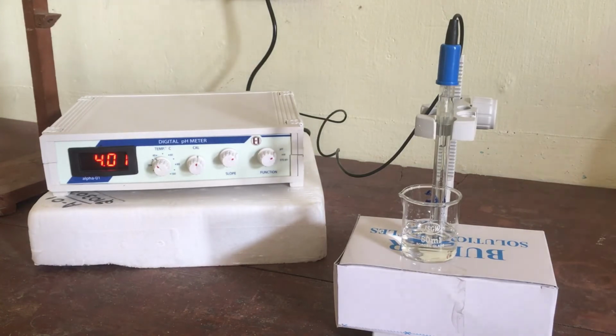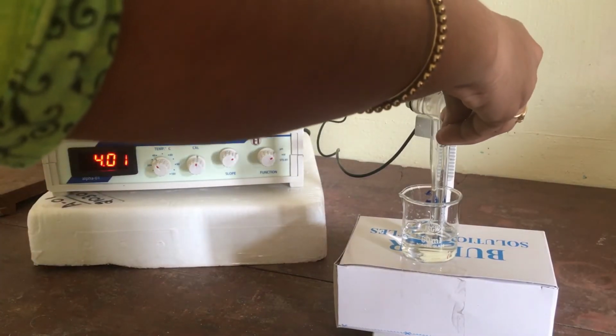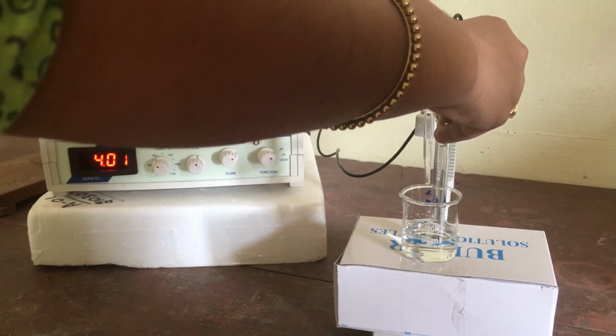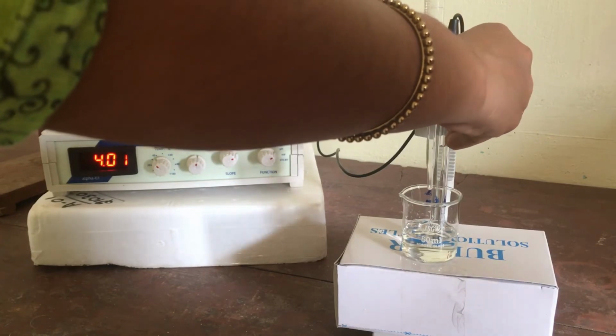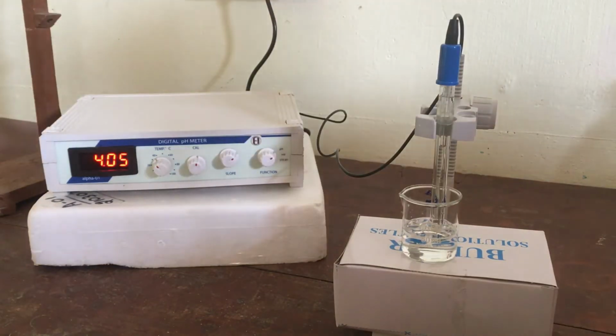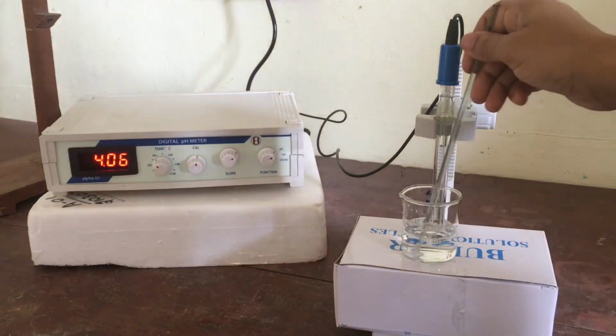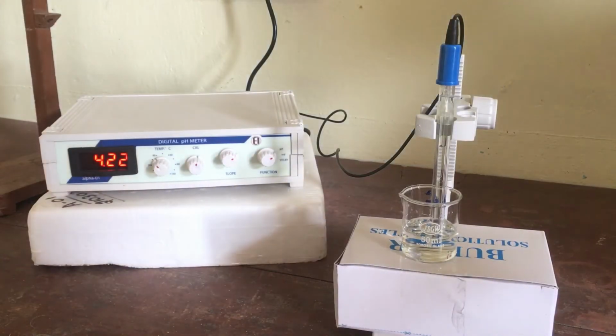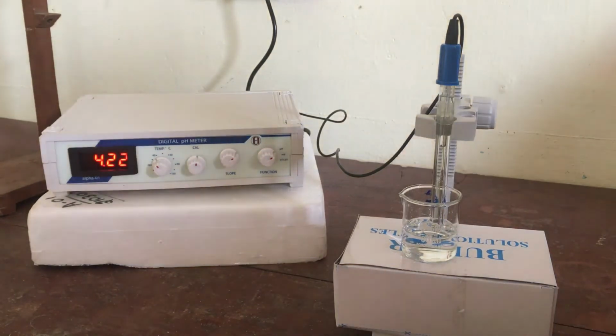The same thing again: adding, then stirring, noting the pH. We have to note down all the values correctly in a notebook. Only after finishing this titration can we plot a graph using the different pH values noted against specific additions of NaOH.